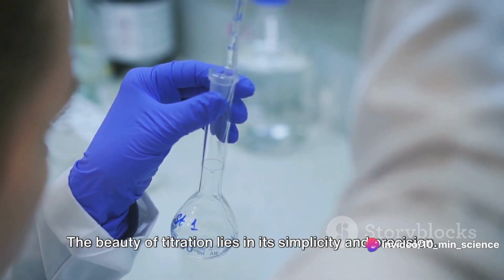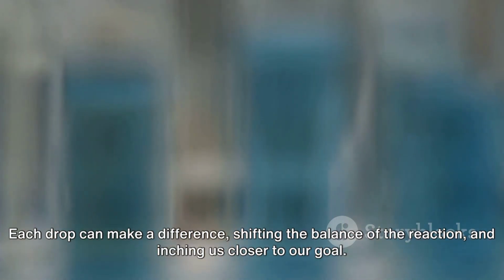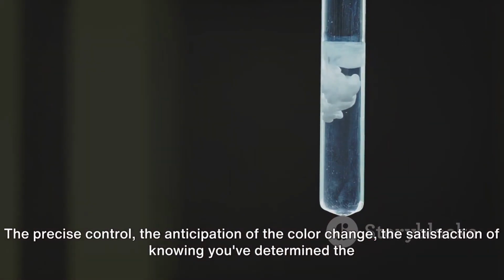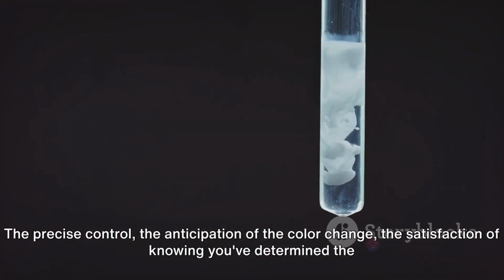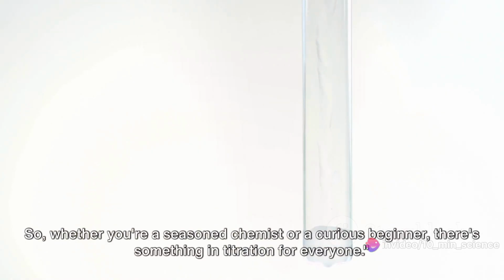The beauty of titration lies in its simplicity and precision. Every drop of titrant we add brings us one step closer to the endpoint. Each drop can make a difference, shifting the balance of the reaction and inching us closer to our goal. In the grand scheme of titration, every drop counts. The precise control, the anticipation of the color change, the satisfaction of knowing you've determined the concentration of an unknown. It's a process that's as beautiful as it is useful. So, whether you're a seasoned chemist or a curious beginner, there's something in titration for everyone.